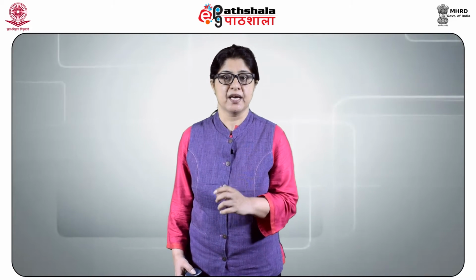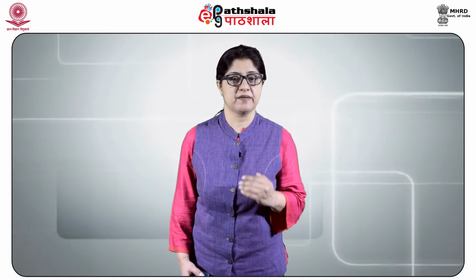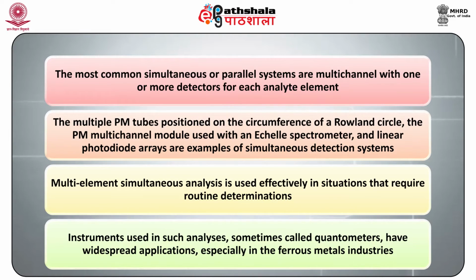Scanning monochromators have a grating or a mirror usually controlled by a computer-driven stepper motor. Linear scanning, rapid slewing to preselected wavelengths and manual operations are possible with these devices. The most common simultaneous or parallel systems are multi-channel, with one or more detectors for each analyte element. The multiple PM tubes positioned on the circumference of the Rowland circle, the PM multi-channel module used with an Echelle spectrometer, and the linear photodiode arrays are examples of simultaneous detection systems.